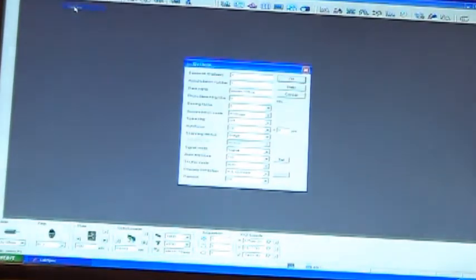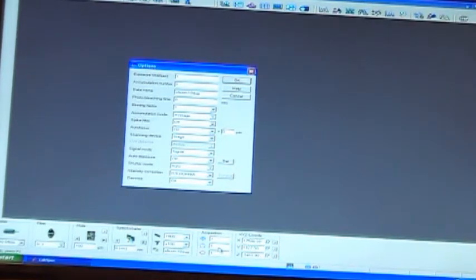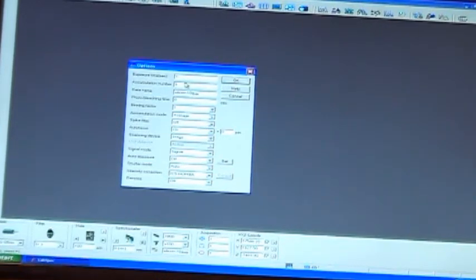Alright, acquisition again. RTD options. Lots of fun stuff in here. So, options going down. The top one is exposure time again in seconds. You can set it here or you can set it down at the bottom of the window. Many of these icons and options are repeated in several locations throughout the software, hidden under several different icons, but they're all the same exact thing and control the same stuff. Again, we have acquisition time, 1 second. Accumulation number is 1. These are copied from down here in the acquisition window at the bottom.